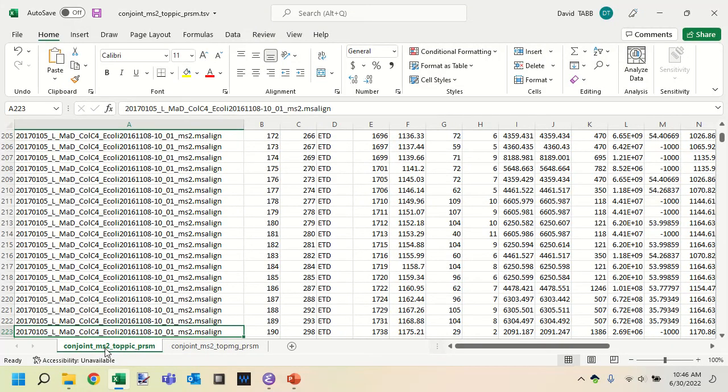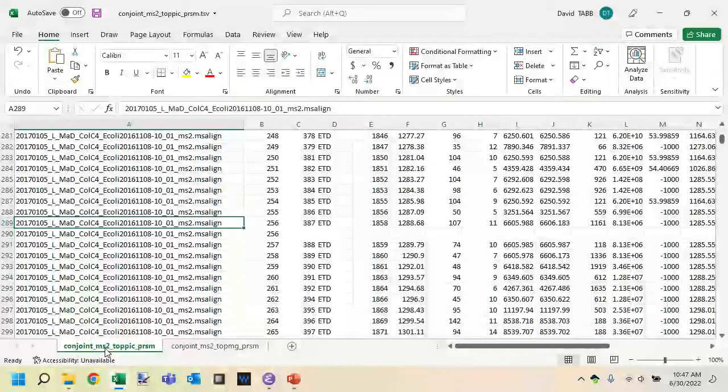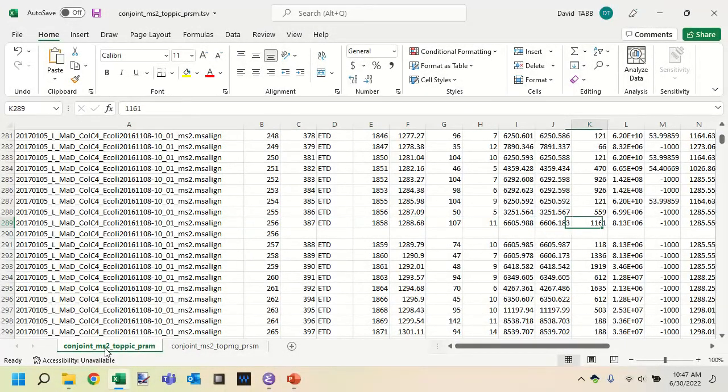In mammalian proteomes, you will frequently find that a given sequence can be explained by multiple accessions in the database. If, for example, you have a proteoform that covers a conserved, shared part of a gene that has multiple splice variants, multiple isoforms, you can find that each of those isoforms is listed as a different accession in the database. And so the same proteoform can be attributed to multiple accessions. In E. coli, that's much less likely to be a problem. But in this case, we do see that there are examples where this does happen.